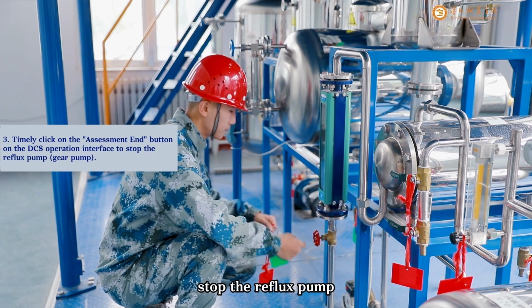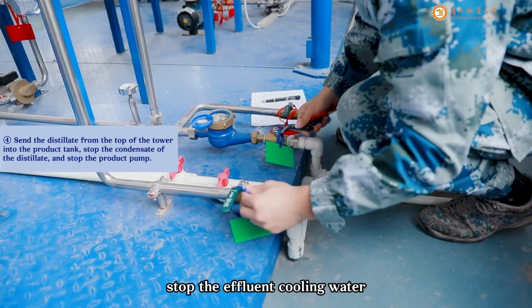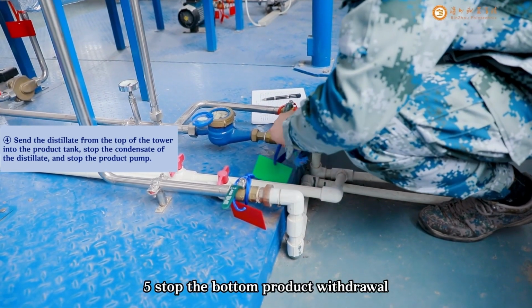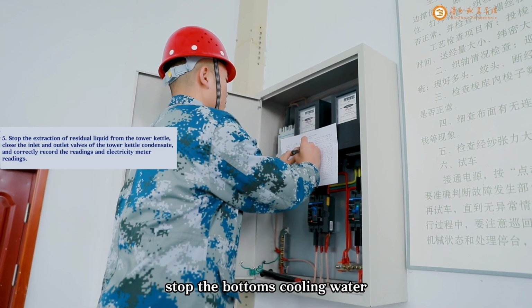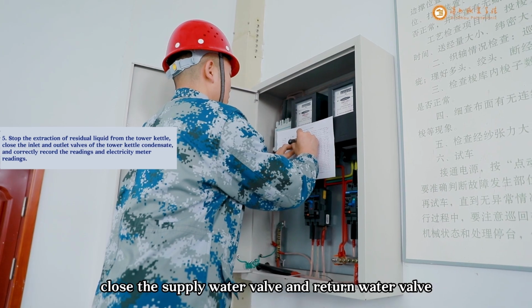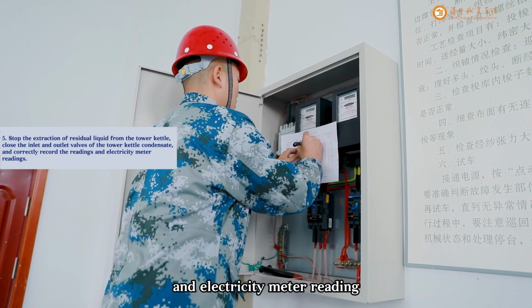Stop the reflux pump. 4. Send the overhead effluent to the product tank. Stop the effluent cooling water. Stop the product pump. 5. Stop the bottom product withdrawal. Stop the bottom's cooling water. Close the supply water valve and return water valve, and correctly record the water meter reading and electricity meter reading.